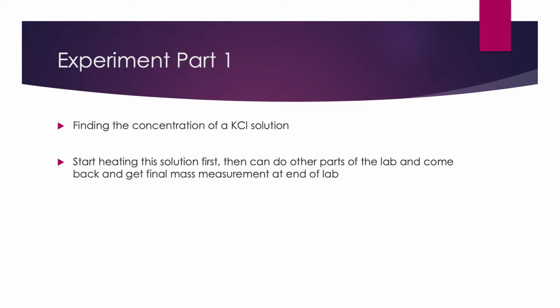This way you can at least be efficient with your time and do those other parts of the experiment while this one is going. So I get this part started first, like I said, and come back to it at the end. And the actual order for the different parts of the experiment really doesn't matter, because each part is independent of the others.